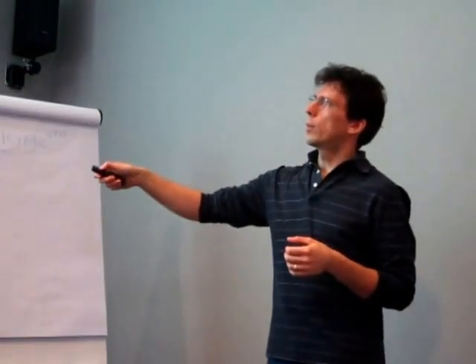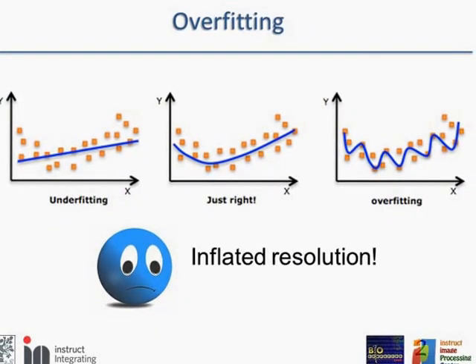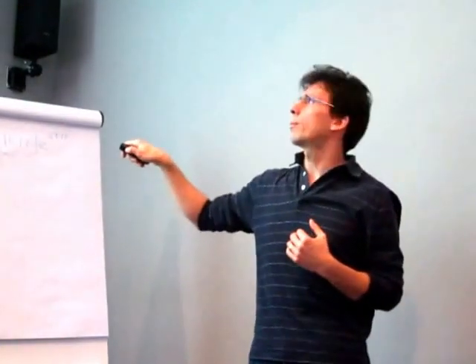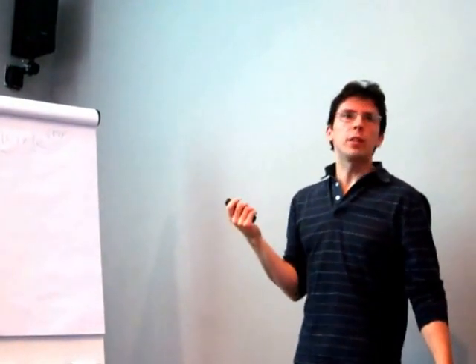So this one goes more or less with the data. This goes better with the data. For instance, this going up here is better represented in this other model. And this other model goes very well with my data, but probably it's not a good model for this experiment, because it is overfitting. It is trying to adapt too much to the particular variations that I have. So here what you are doing is overfitting the noise.